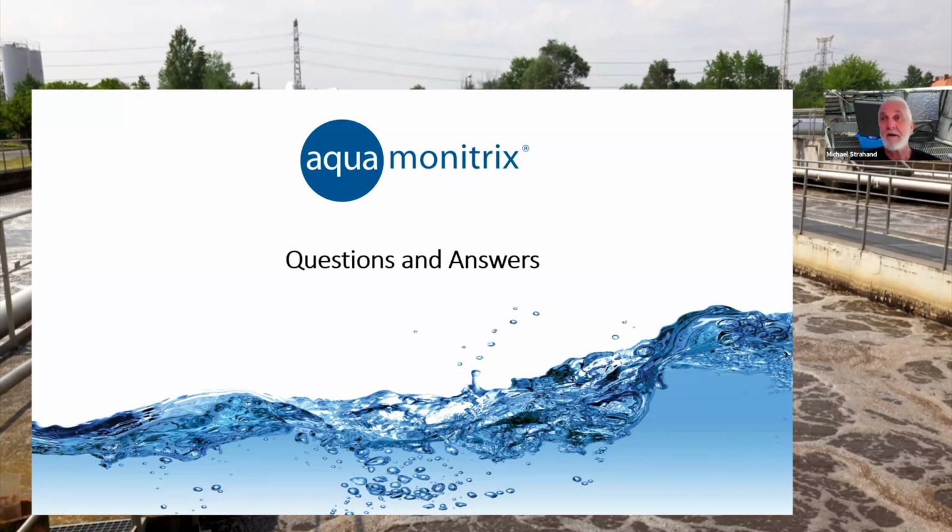And we saw that affecting the readings. We'd heard that before from a couple of clients that they thought it was a possibility, not necessarily just with aquamonitrix, but with other systems they were using on site. And we have a couple of data sets now which absolutely definitely show that if you leave these pre-treatment systems too long between cleaning, it definitely affects the reading. We have got installations on MBRs and MABRs, but if you wanted to dig into that in a bit more detail, feel free to send an email to Eoin or myself, and we'll do that.